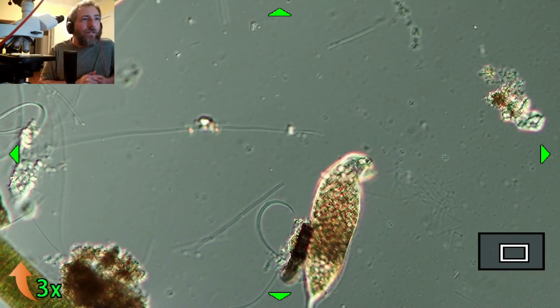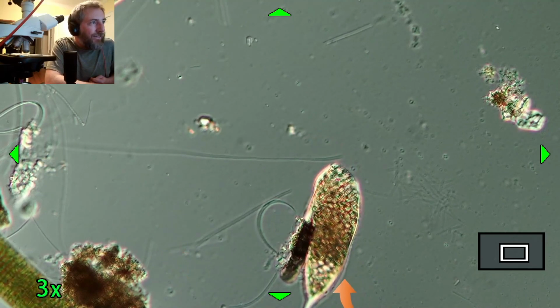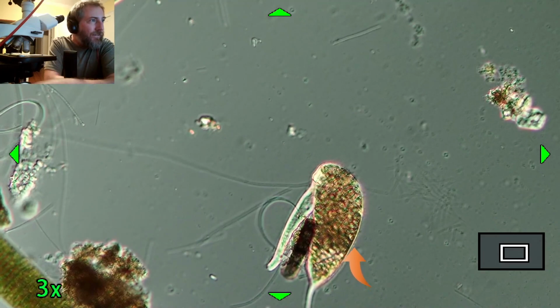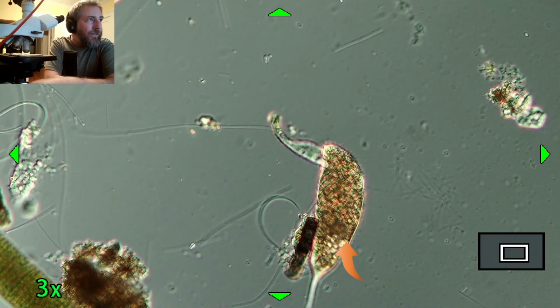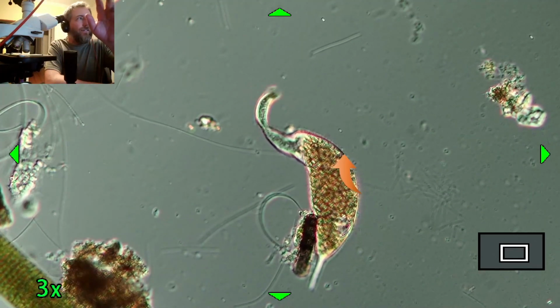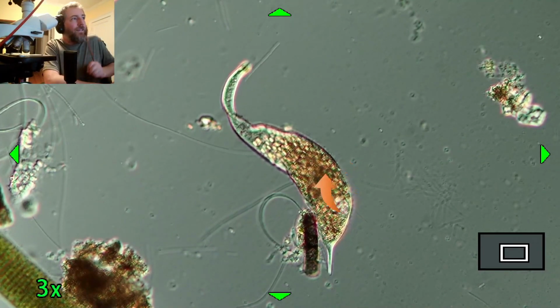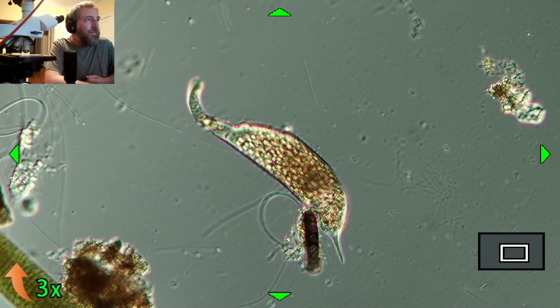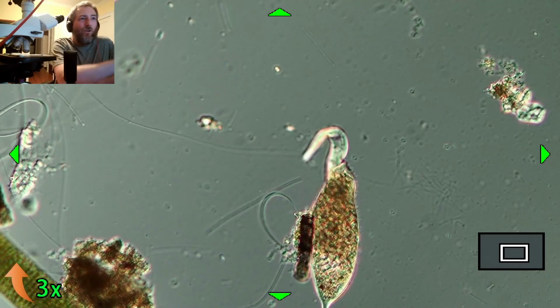How does it move? How does it propel itself? So, you can see around the outside edge, there's this sort of glimmer. There are little tiny hairs all around its body, and it uses those for mobility. Those little glimmers are little hairs, moving like this. Because they're so small, the water is a bit more like a solid for them, or like a gel, and so the little hairs moving allow them to crawl through the water.